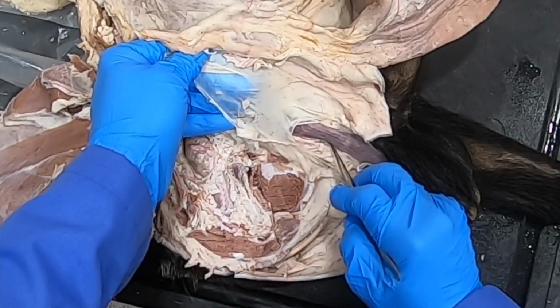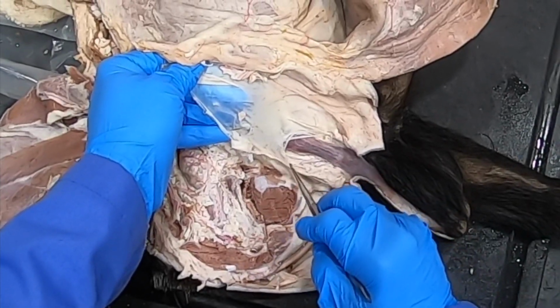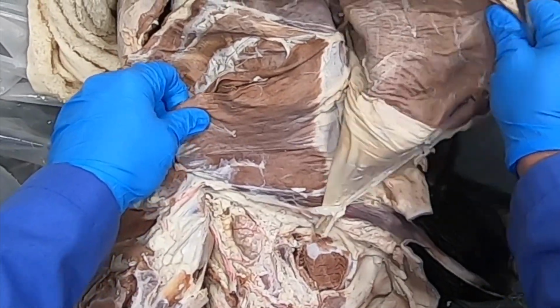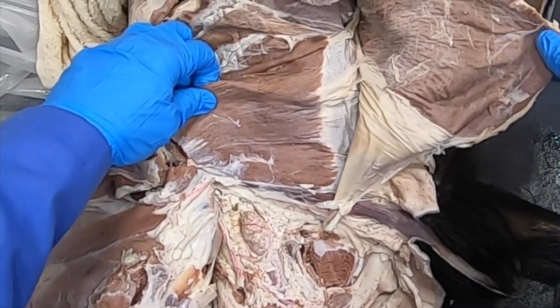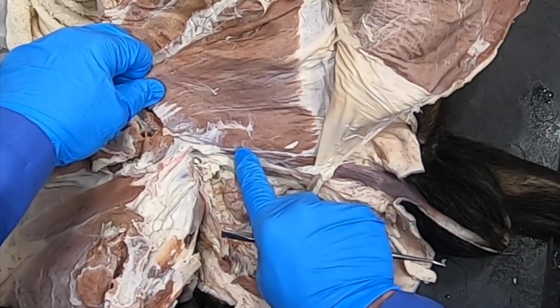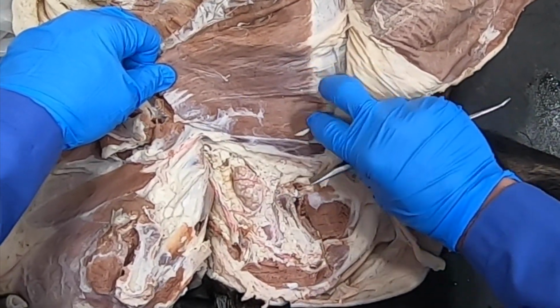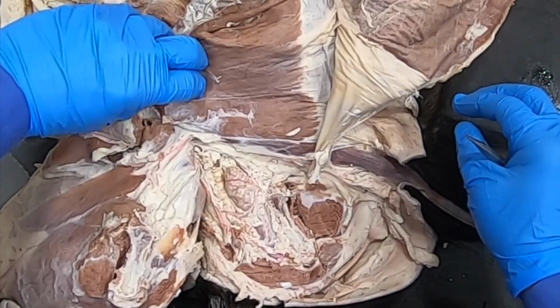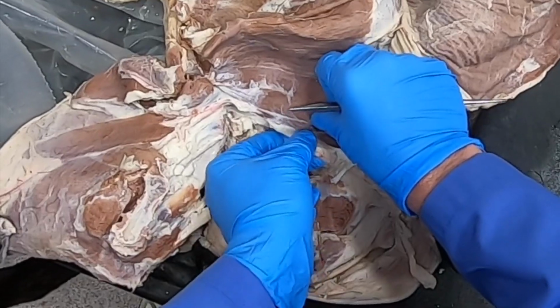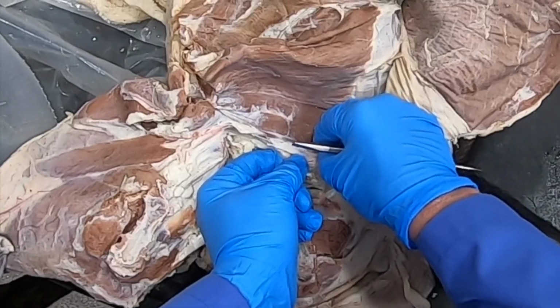and the genitofemoral nerve. I don't have those dissected to show you that here now, but if we then reflect that external abdominal oblique, we see the internal abdominal oblique muscle, and its caudal edge is giving rise to our cremaster muscle. Okay, and remember, its caudal edge is also our cranial border of our deep inguinal ring.